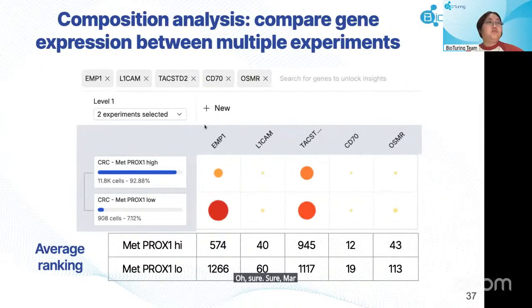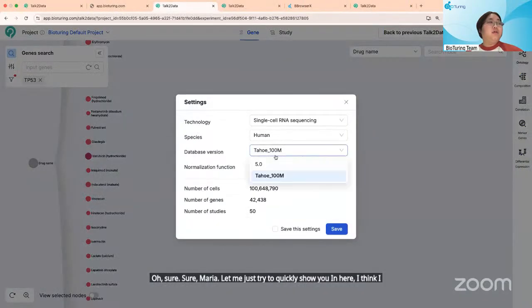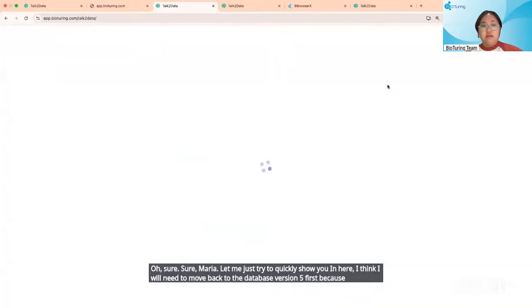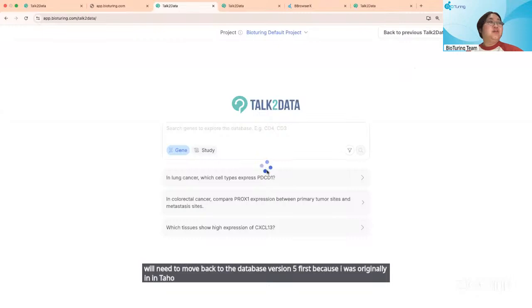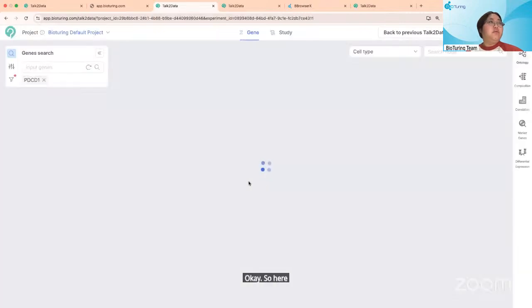Oh, sure, Maria. Let me just try to quickly show you. I think I will need to move back to the database version 5 first, because I was originally in Tahoe 100 million. Okay, so here I am.